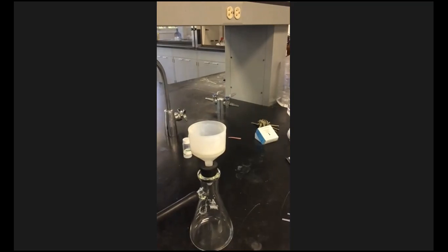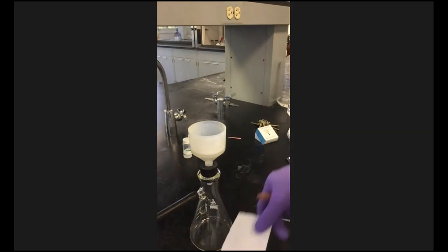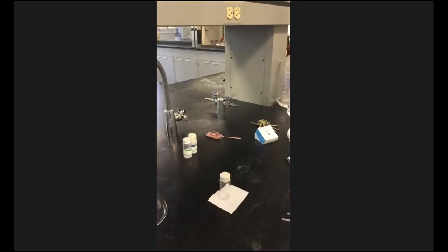And once the precipitate has settled and the supernatant has cleared, which we've done, label one calcium chloride and the other potassium oxalate, and remove 1 milliliter of the supernatant and transfer. So let's do that. I don't have a Sharpie, but we can do this. I'm going to put it over here, and I'll move the camera because I do have these solutions made up.